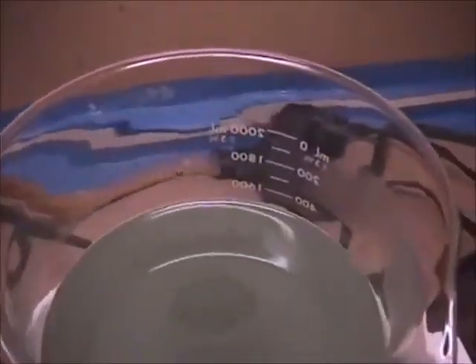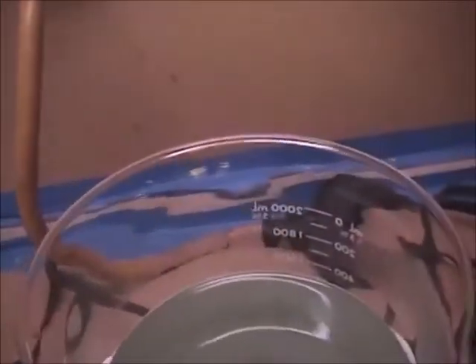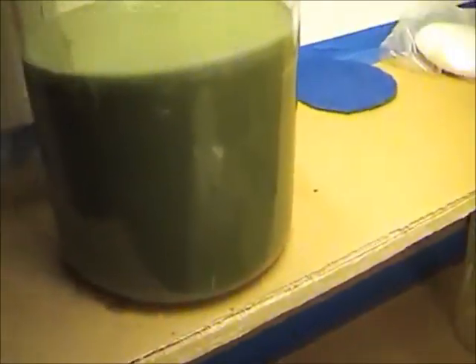Let's move our other beaker over here in my good light source, so I can set this up there and give you an idea of what's fixing to occur. If you look towards the bottom, there's a real fine ring around the bottom, but we haven't started any heavy precipitation yet. So we'll give that just a second. Add just a touch more sodium formate to it. When I did this a while ago, it took a minute or two to kick in, and then it just started snowing silver.